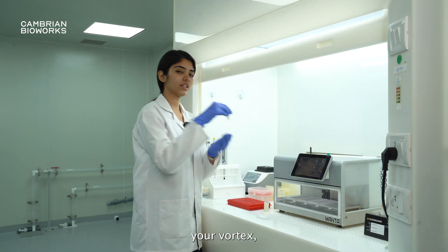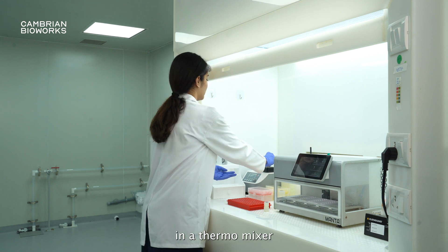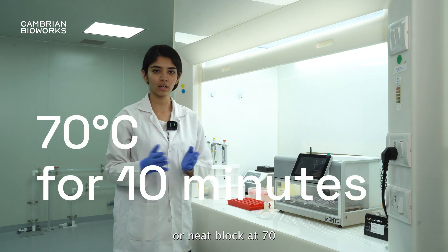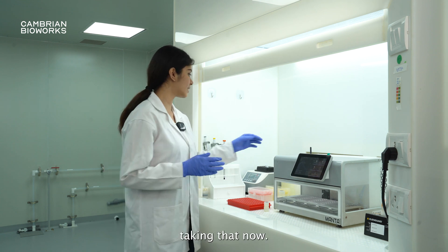Now, you vortex your sample for 30 seconds and you place it in a thermomixer or a heat block at 70 degrees Celsius for 10 minutes. I've already placed mine at 70 degrees Celsius for 10 minutes, so I will be taking that now.